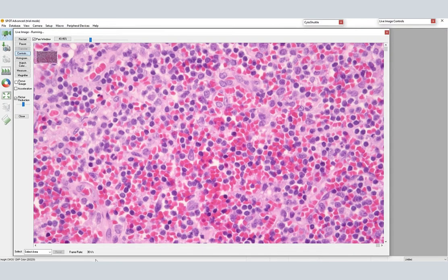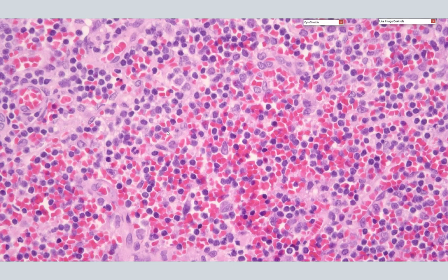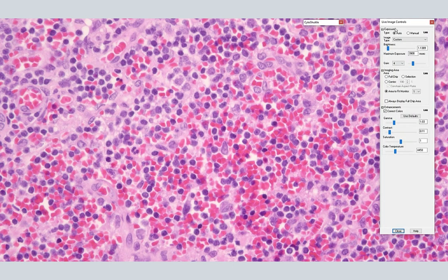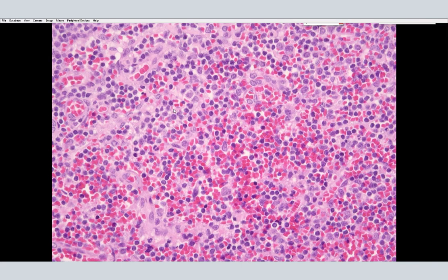And we're running at right now 30 to 31 frames per second. And that's so when we're doing the fit to screen. If we want to, we can actually change this, because maybe you would like to see the whole chip. And so we'll go to the full chip mode, which is the 12.3 full resolution. So that's the full chip. You see, you get the black bars on the sides.